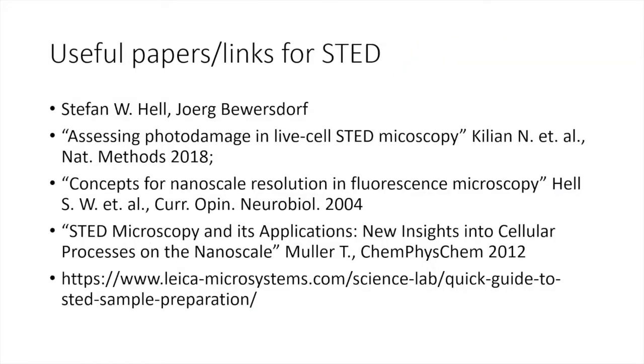I just want to show you some useful papers for STED. Of course, the inventor of the STED technique is Stefan Hell, and the second person is a PhD from his lab, and he actually has his own lab now. So following these two labs, you can see the most advanced techniques and research.